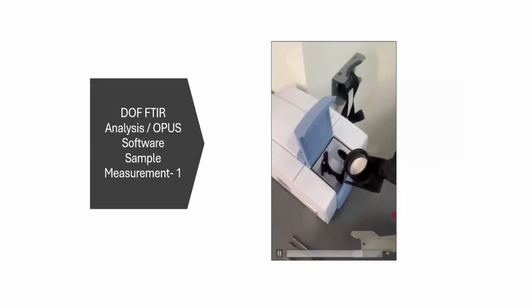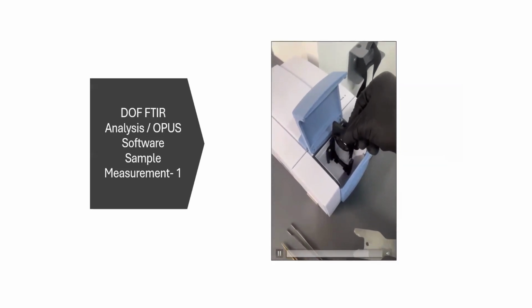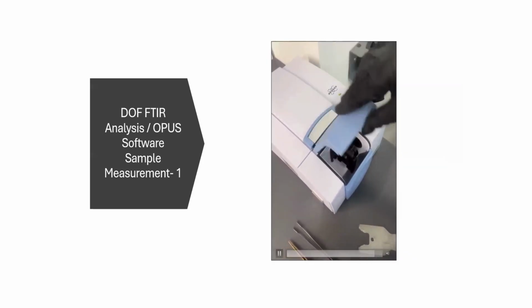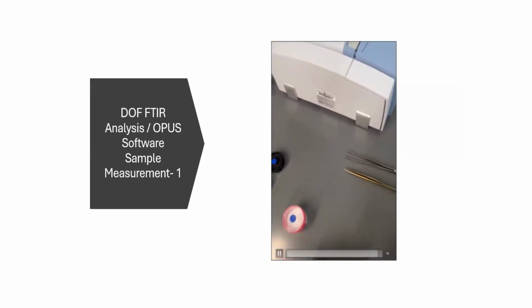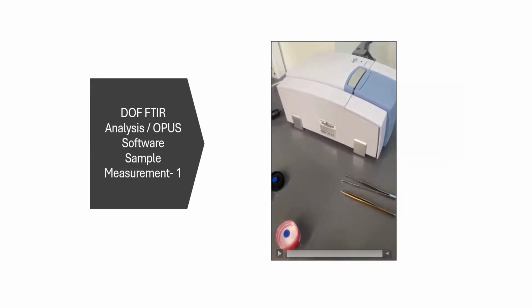So we are ready to load this filter into the FTIR instrument. A quick reminder, when you are removing or inserting a filter that has dust on it, you want to be very careful not to shake your dust off of it. Otherwise you will lose some data.